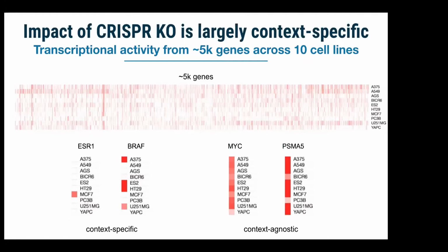So we do see some differences in those patterns, but overall, I think it's worth noting for people who plan on working with this data, the signal is fairly sparse, and it can be quite dependent on the particular cell line. And one thing we've noticed is that the baseline expression of the gene is very important in determining whether you get an active signature in the particular cell line. So that's something that's worth keeping in mind for folks who plan on working with this data.